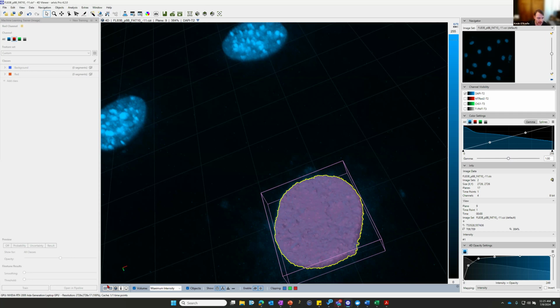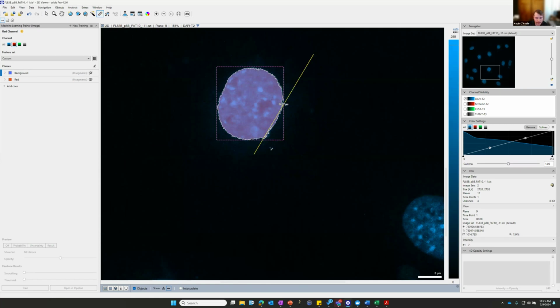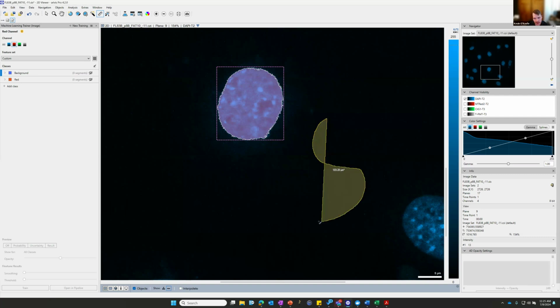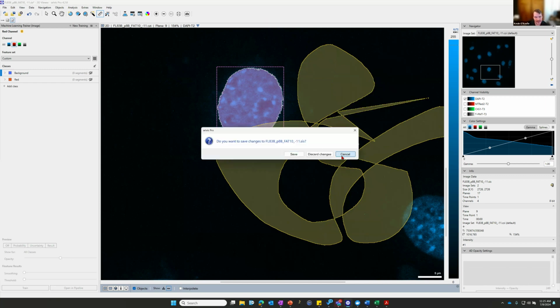Okay. Then a measuring tool. If you're curious about the size of objects, you can also do the area, or an ROI here, or we can do an area or something. You can do it really crazy if you are so inclined. Actually, I don't want to do that.